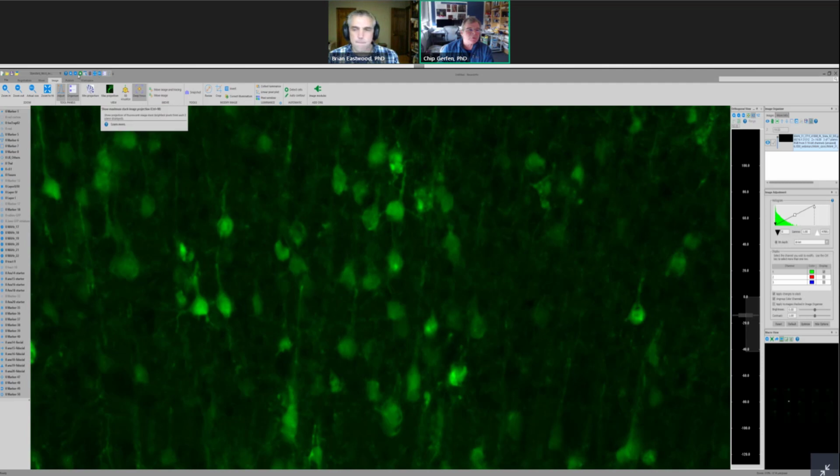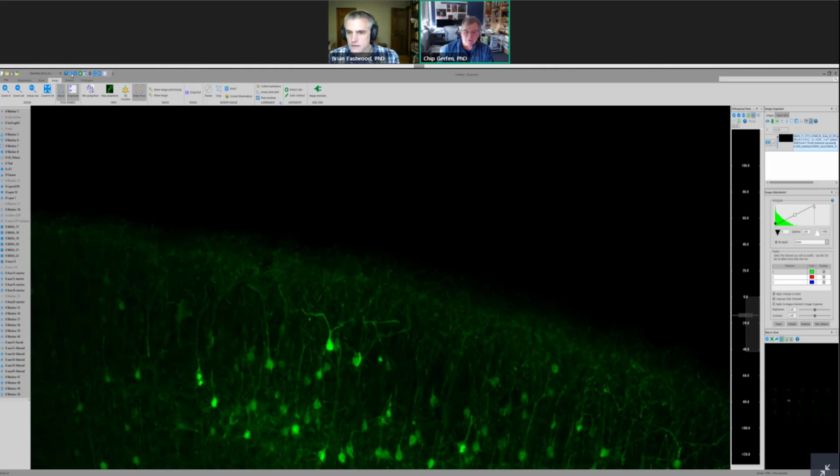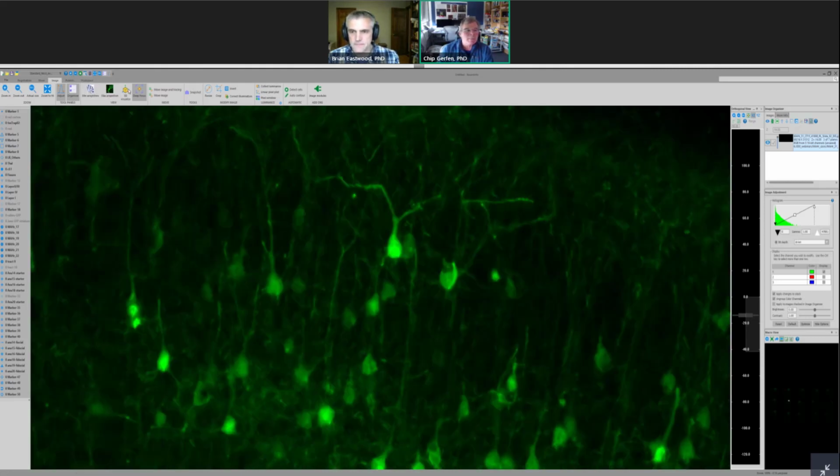And this is quite dramatic in certain areas, like when we zoom up and look at the dendrites. I'm sure that people that do microscopy have always seen this, where things are in and out of focus. You can see how the dendrites are out of focus. And a bunch of those cell bodies too. The cell bodies as well. Now when we apply the deep focus, you can see how this basically brings everything within this 50 micron section into optimal focus. And so this is essential for actually being able to accurately identify and have the cells in the whole section marked. So I'm going to now leave this.